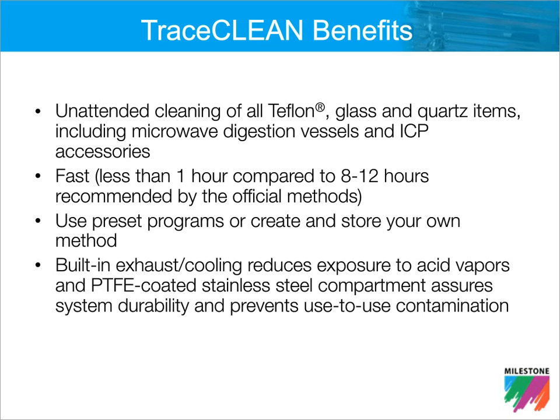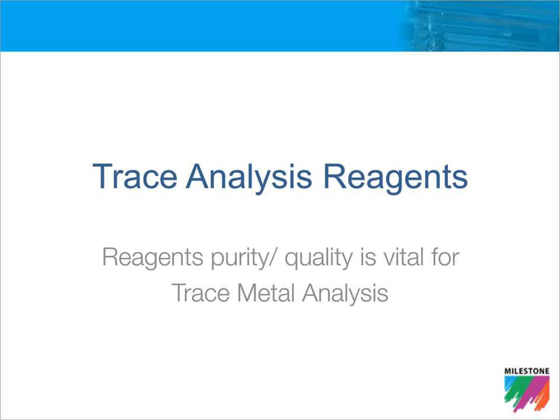Now, in addition to cleaning, as Dr. Nobrega mentioned, the purity, the quality of the reagents is extremely important during the trace metals analysis process. For example, when we're doing a digestion, the amount of acid being used is considerably greater than the sample that we're actually digesting. If you think that a quarter gram of sample when we're doing a microwave digestion typically takes 10 grams of acid, it is critical that the concentration of our elements of interest in that acid are far below the concentration of those elements in our actual sample.